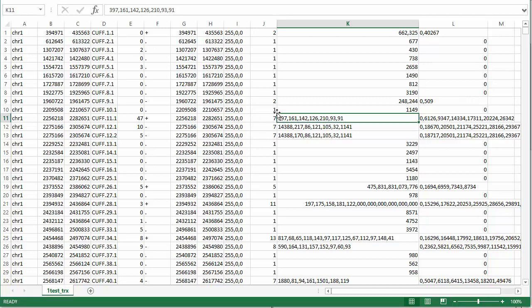And then additional information about exons if there are exons. Every field past the strand is optional, but has to be in the same order, so you need to enter something in the fields preceding any other later one that you want to include.